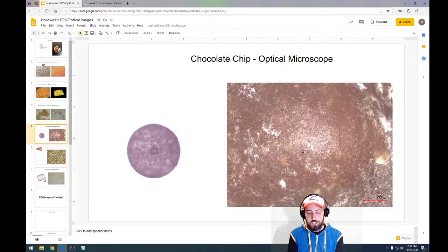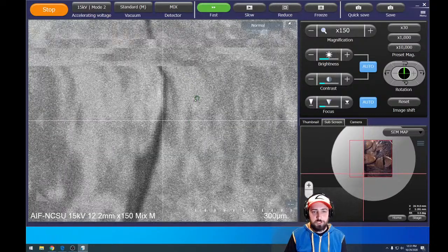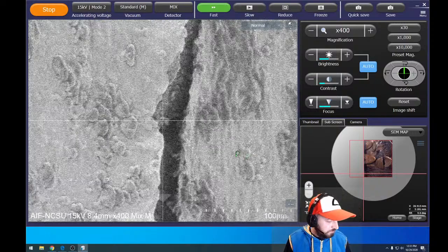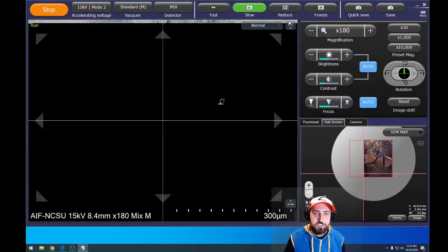So we know that chocolate chips have kind of like the curlicue at the top. And in fact, Hershey Kisses, if you've ever seen those, are basically the same thing, just made a little bit bigger. And so we're looking kind of top down at the peak of that mountain. And now we're looking at the chocolate chip in the electron microscope, and I'm going to refocus. And we're going to zoom out just a little bit and then start scanning slowly.